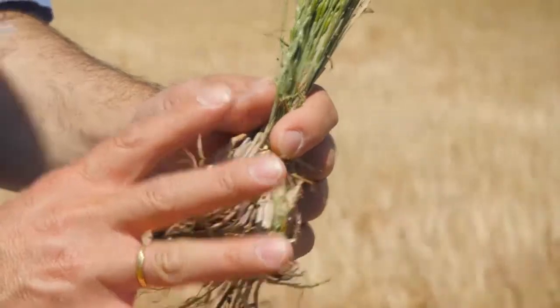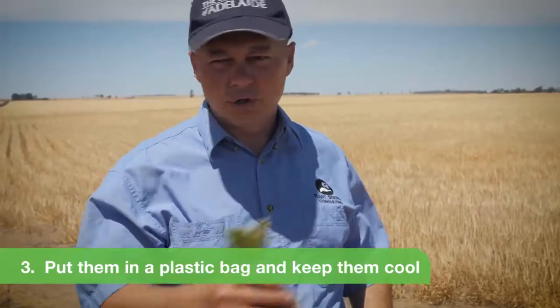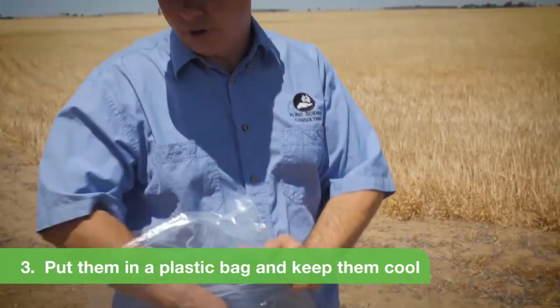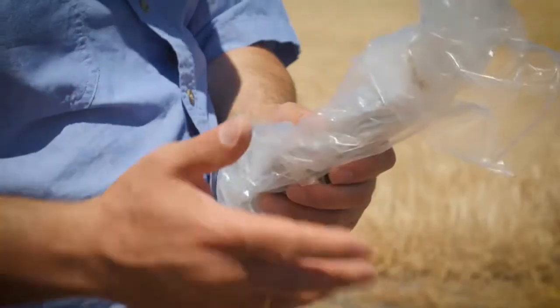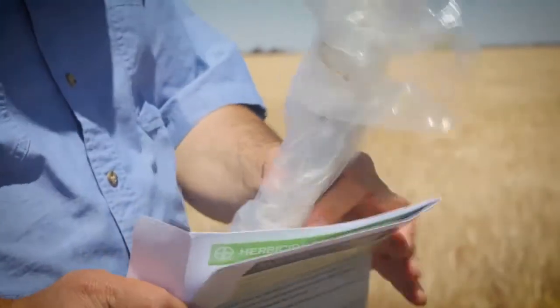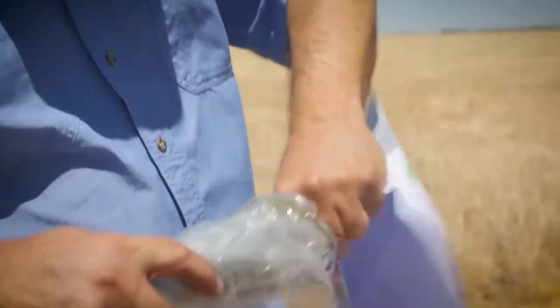These plants are simply placed in a plastic bag. No water, don't need to add any water at all. Kept out of direct sunlight. If you pick them on a Friday, you maybe put them in the fridge and post them to us. The beginning of the week is a lot better because it gets to us during that week. They can then be placed in the Bayer bag.